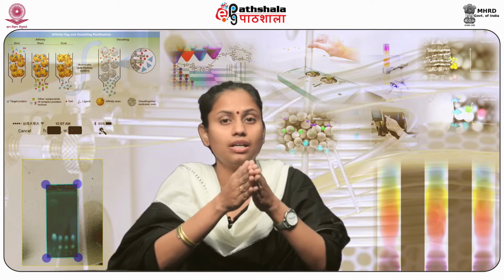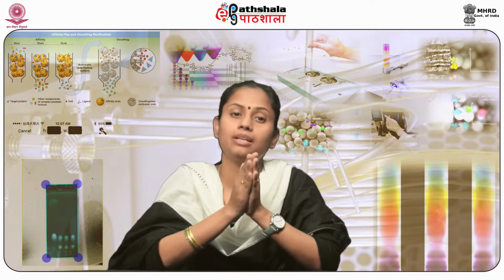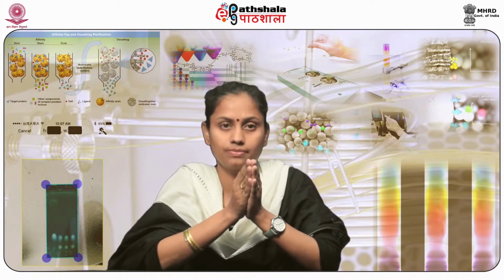Next, the mobile phases used in ion exchange chromatography are aqueous acid and base solutions. It can be an organic solvent, a non-aqueous solution, or a combination of solvents.